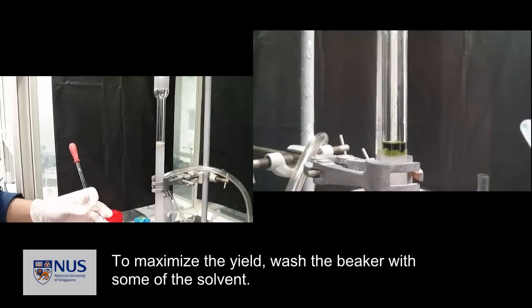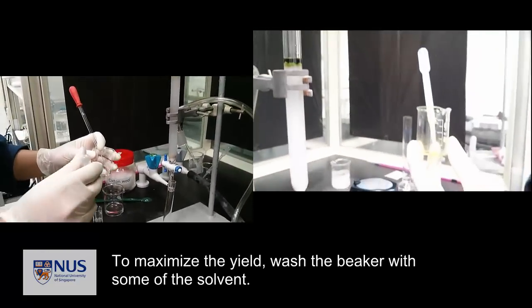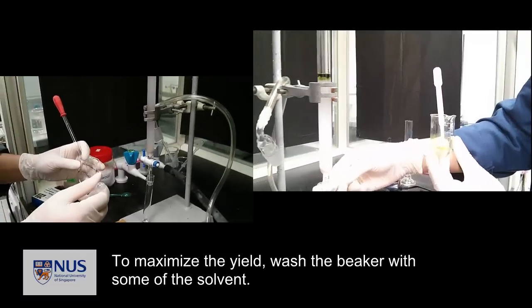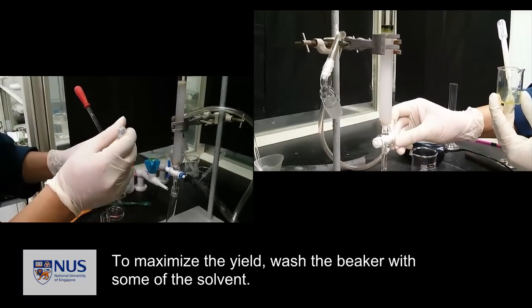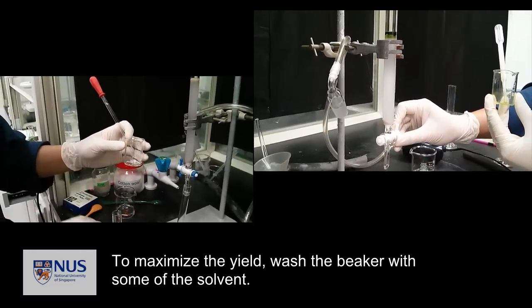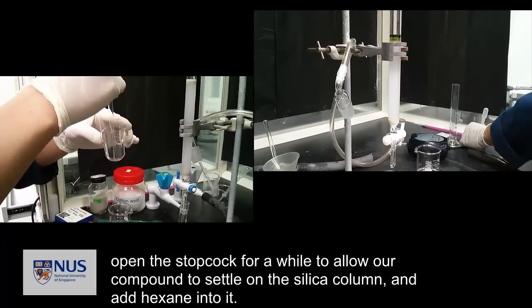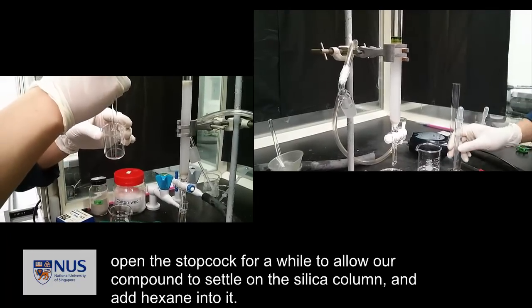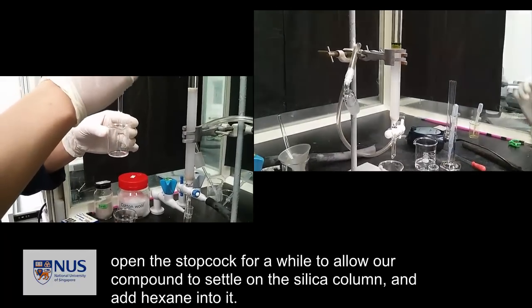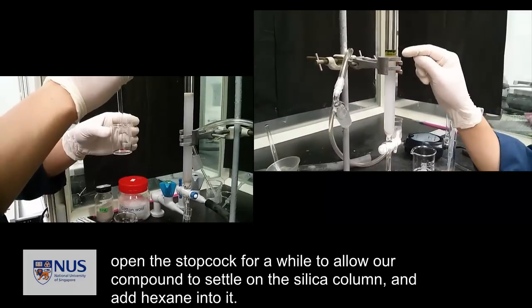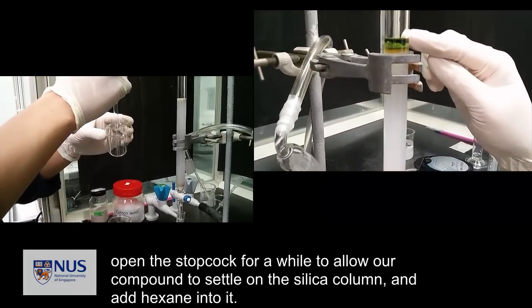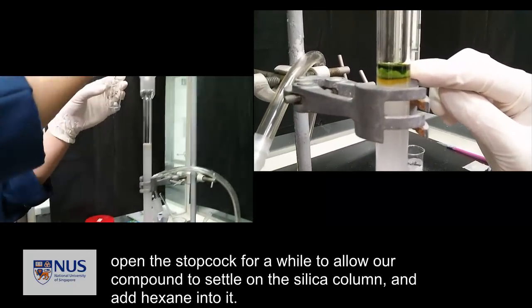Circulate the dropper as you add into the column. To maximize the yield, wash the beaker with some of your solvent. Open the stopcock for a while to allow our compound to settle on the silica column under normal pressure.